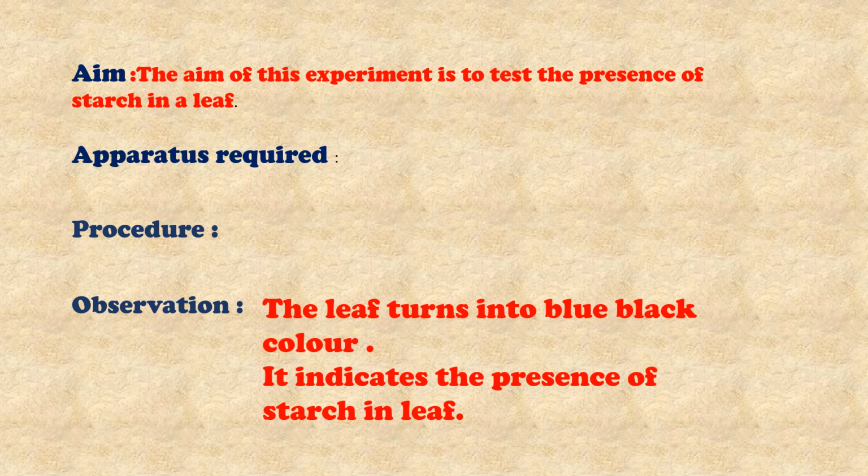Observation: the leaf turns into blue-black color. It indicates the presence of starch in leaf.